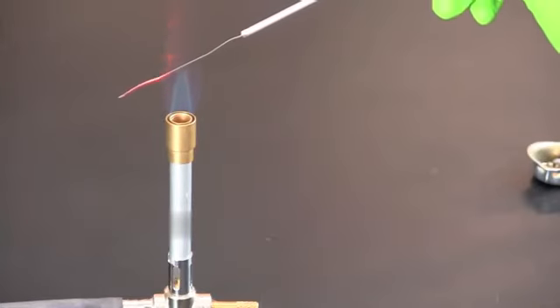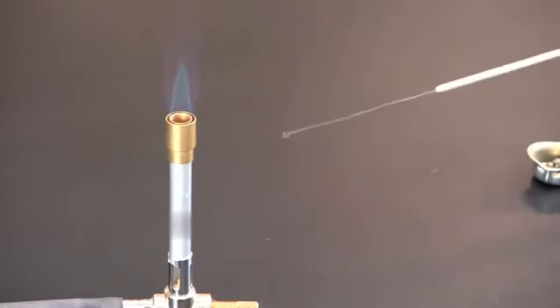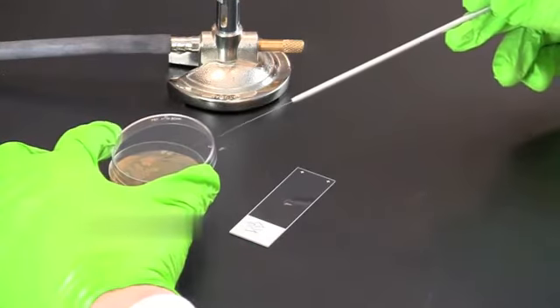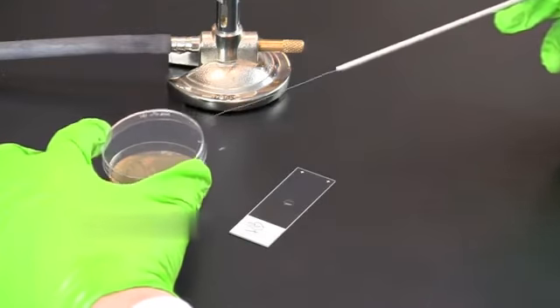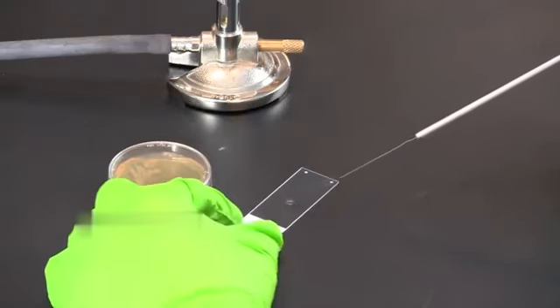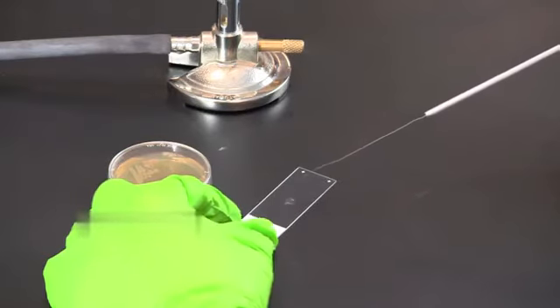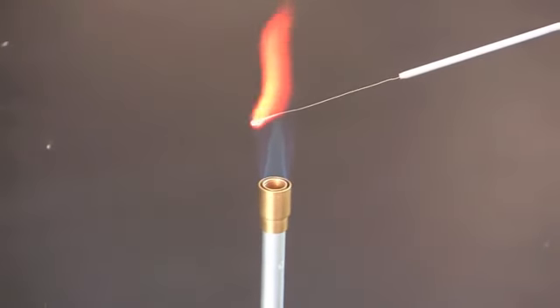Flame the metal loop again to sterilize. After allowing it to cool, use the metal loop to transfer a colony of bacteria growing on an agar plate. Make sure to lightly touch the bacterial colony to avoid transferring too many bacteria. When finished, flame the loop to sterilize.